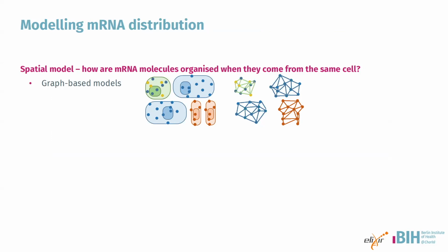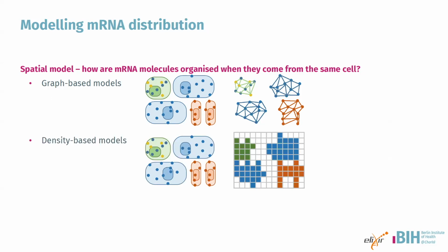So the cell segmentation-free approaches are basically broken down into 2 types of concepts. One is based on graph-based modeling, where you have a graphical model of spatial relationships between transcripts. And others take a density-based approach. So figuring out within particular regions, what is the gene expression density, and using this to classify.